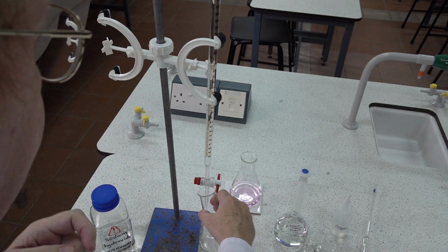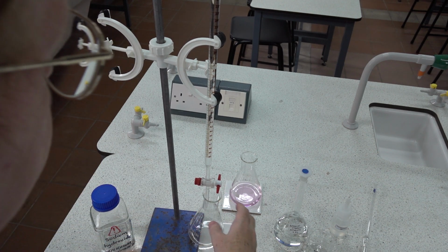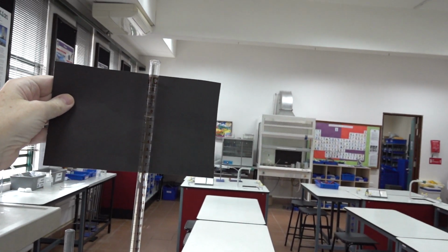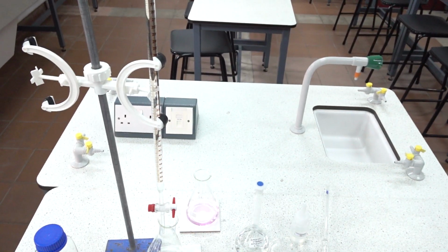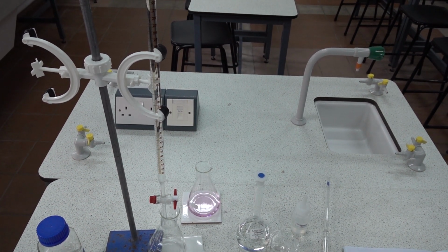Make sure that the flask is well below the level of the tap so that none of the solution falls outside of the flask. And we need to take an initial reading on the burette. We can do that by looking across here. You may be able to pick that up on the camera. That is 0.7 centimeters cubed, which we write in our lab book.